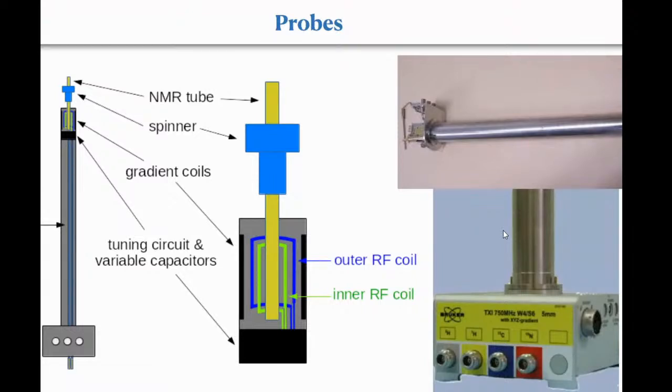So what we do, we have this inner RF coil tuned to carbon 13 or X nuclei, we call them X nuclei, and the outer coil tuned to only proton or hydrogen nucleus. Okay, so this happens in that one. Now, if you have a TXI probe, there will be three coils, and that will have different sensitivity, carbon 13 and 15N. Probably carbon 13 and 15N will be tuned to one particular frequency, and proton, of course, will have a different frequency. And there is always one other thing, that is the deuterium. This deuterium is for the lock, and that channel will always remain open.